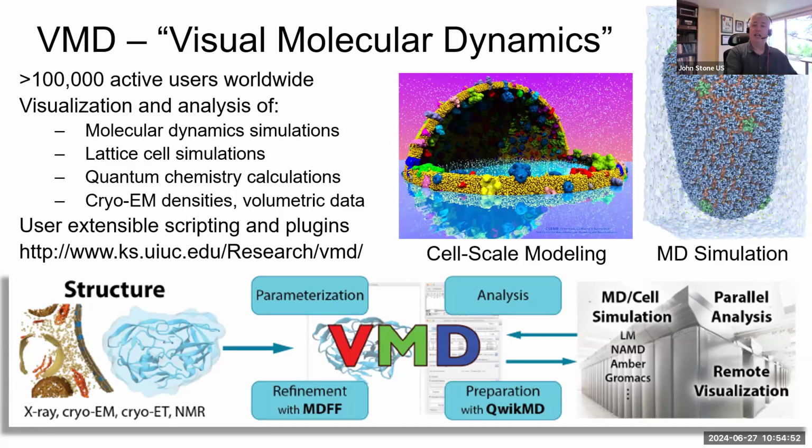And you can use that also over large structures. So I'll go to the next slide here, if it cooperates.